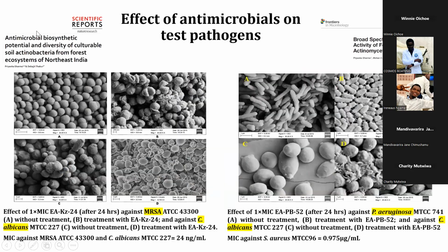Now, I have also done some scanning electron microscopy to see how these antimicrobial substances have acted on the pathogens. So here, this is the control MRSA, and this is the control Candida albicans.